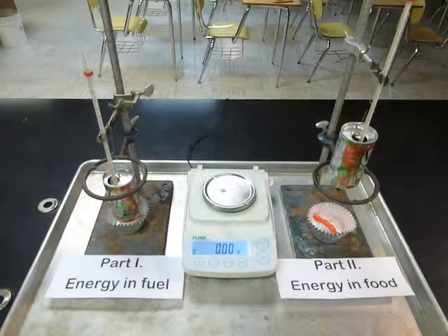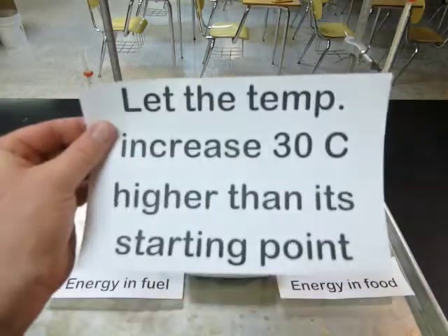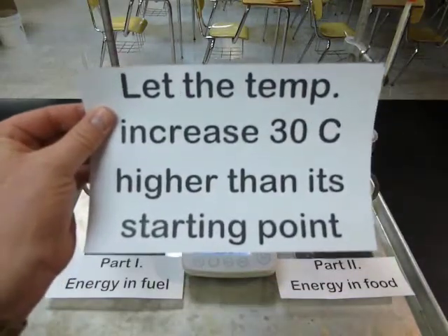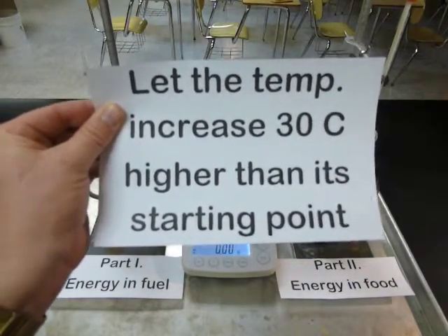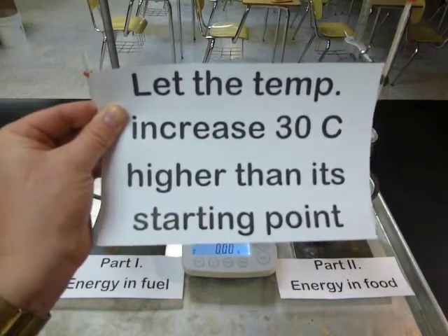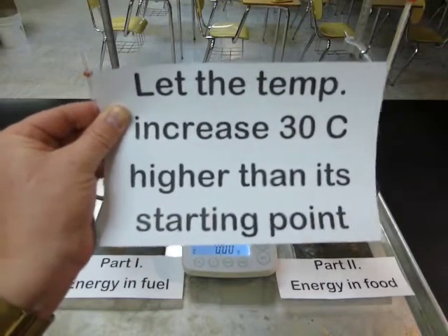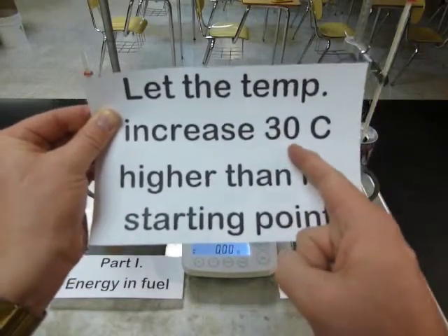And what you want to do is watch the thermometer, and you want to watch the temperature rise, and you want to let the temperature increase about 30 degrees Celsius higher than its starting point. That doesn't mean stop at 30 degrees, that means go 30 degrees higher than where it started. So if it started at 25 degrees, then you would let it go up to 55 degrees, which would be an extra 30 degrees Celsius.